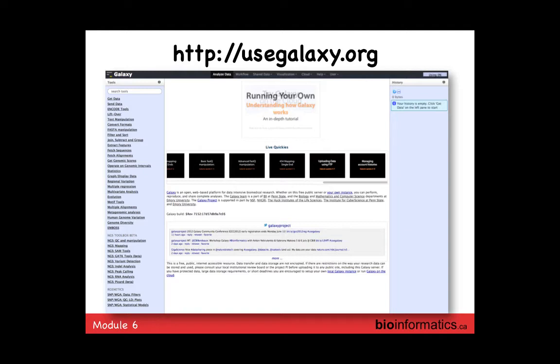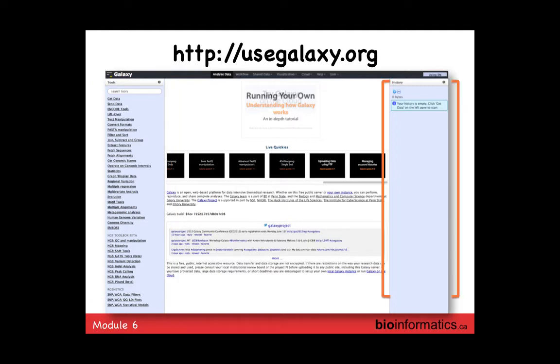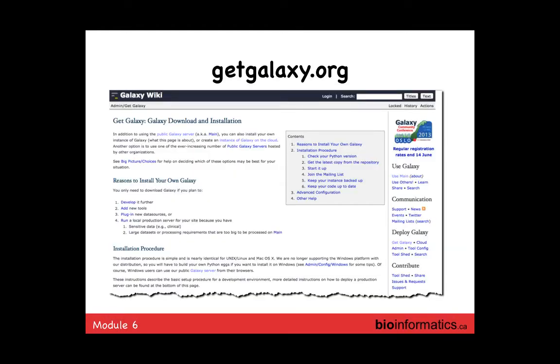The usegalaxy.org homepage: on the left side are all the tools and actions you can use to get started; on the right side is your history of what you've done; and in the middle is the results, parameter settings, and activity area. The getgalaxy.org site has a very active user community to help you install and run Galaxy. When we installed Galaxy at OICR, the team was very helpful and even offered to send a developer to assist with local installation.